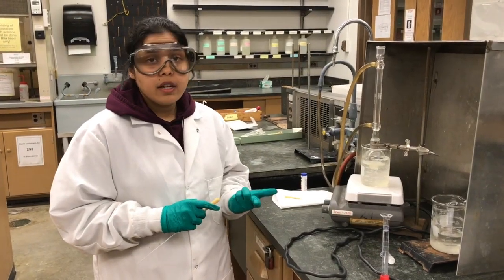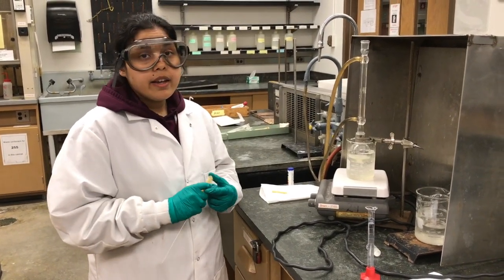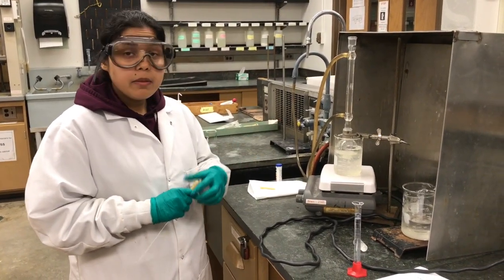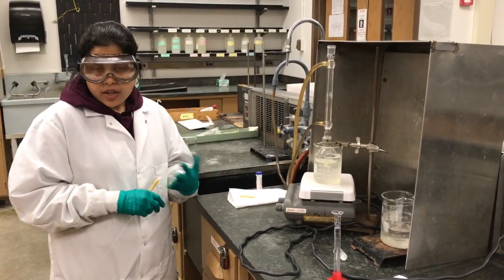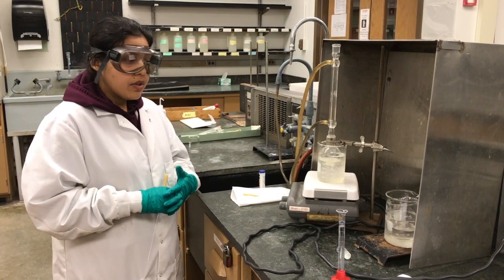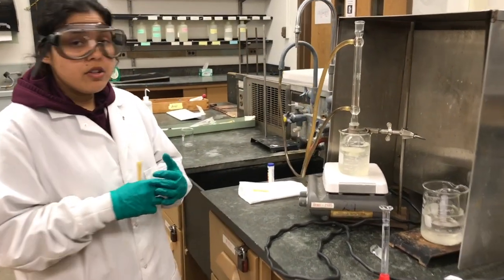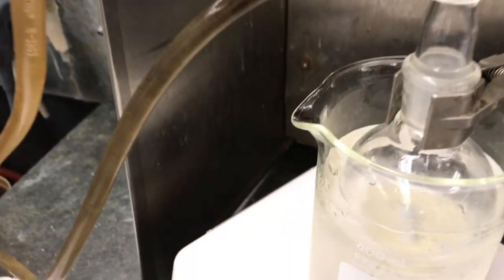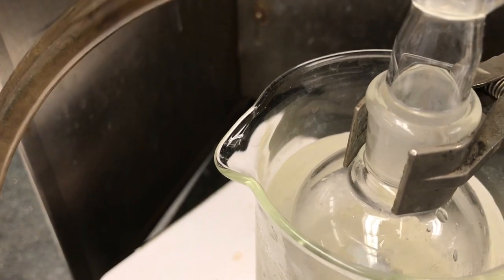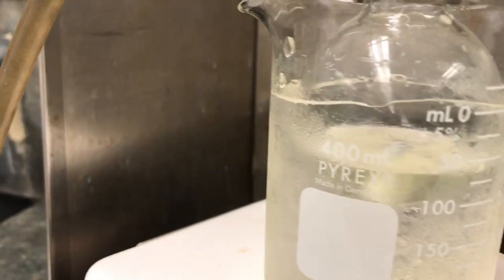So we have added sodium borohydride to our ethyl vanillin and stirred it for 30 minutes. As you can see here, the reaction mixture is yellowish and it's kind of clear. There are no solids that I can see here. After putting the condenser on and stirring for 30 minutes at room temp, we have put the ice bath in here.